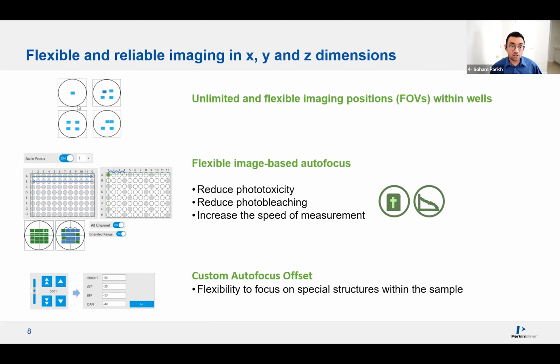This could be really useful if someone is going to use this instrument for confluency analysis or cell proliferation analysis. Conventionally, what I used to do was get a stitch right in the center of the wells, create a montage or stitched image of 2 by 2 in the center, and then interpret that as the confluency readings. But with the MuviCyte, you can also select one single field of view in different locations. You can select all the fields of view with a lot of freedom wherever you want, and that would give you a more sophisticated readout of what is actually going on.